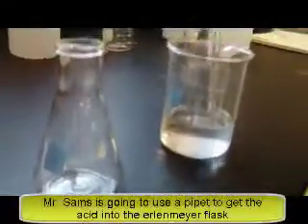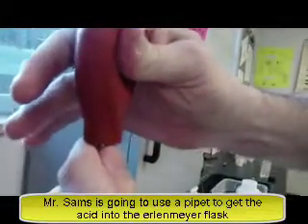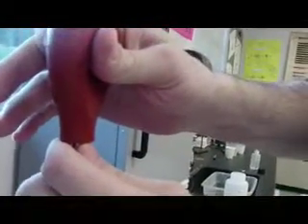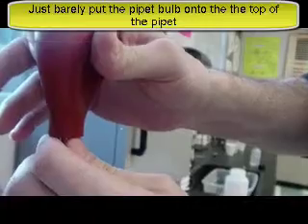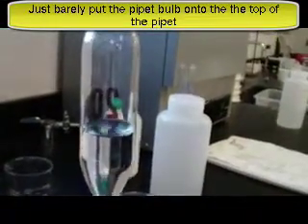So we need to get our acid into our flask. Here's the acid that I want to titrate. I'm going to put 20 milliliters of the acid. Now remember, don't jam the suction bulb down onto the pipette. Make it so you can easily pull it off. What I've been telling my students lately is when you pipette, just make the suction bulb kind of kiss the top. Don't jam it on there, just make it kiss the top a little bit. If I can get it up there. Come on, you can do it.